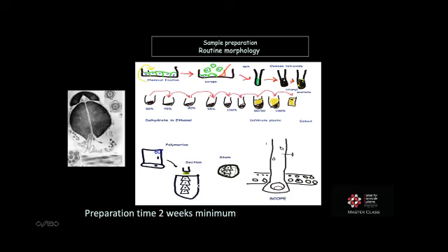We start with chemical fixation. If we're looking at cultured cells, then after fixation, we would want to scrape the cells off the plate, spin them into a pellet, stain with osmium tetroxide and uranyl acetate, fully dehydrate the sample, infiltrate with our plastic, put that into a molded block and polymerize the plastic at 60 degrees.